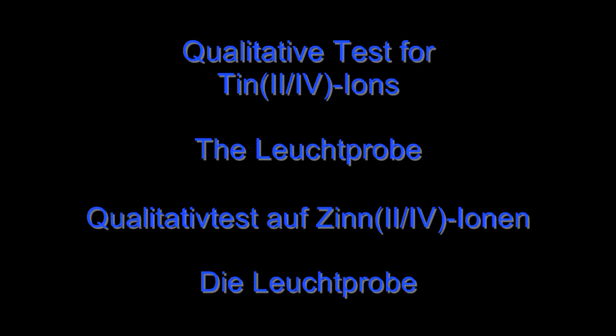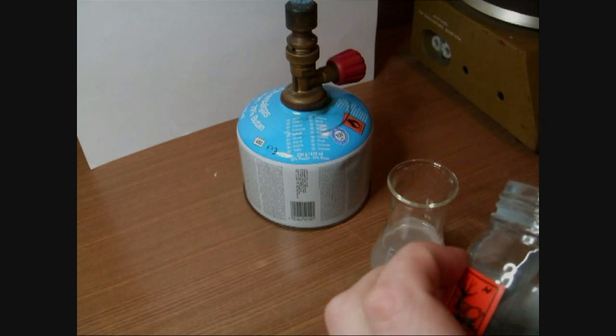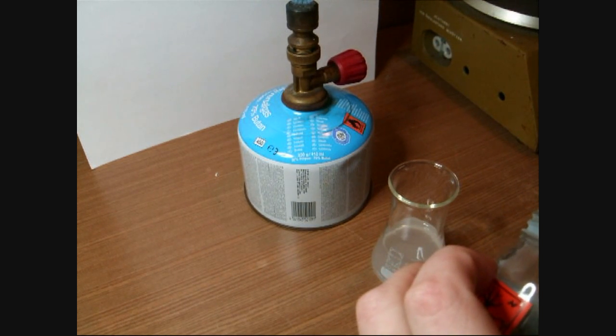Hello and welcome to another chemistry video. Today I want to show you a method to detect tin ions in a solution in presence of nascent hydrogen, also known as die Leuchtprobe.